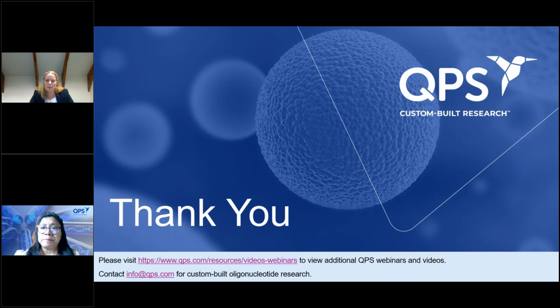Yeah, so what we normally do to obtain the tissue homogenate is that the last step is a centrifuge step. So normally we don't need to centrifuge the samples when we have them in the assay. We had one incident where it was needed. We saw a bit of tiny debris, and there the centrifugation really led to better results. It's not standardly implemented, but it can be.